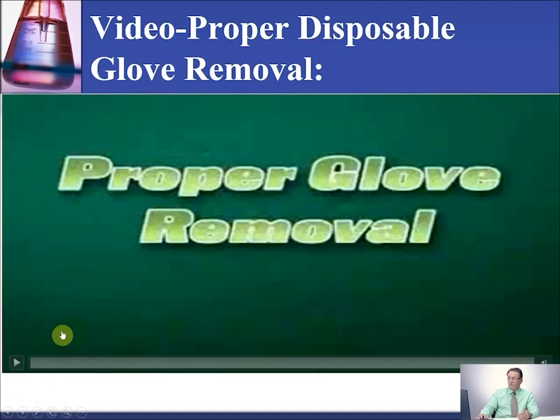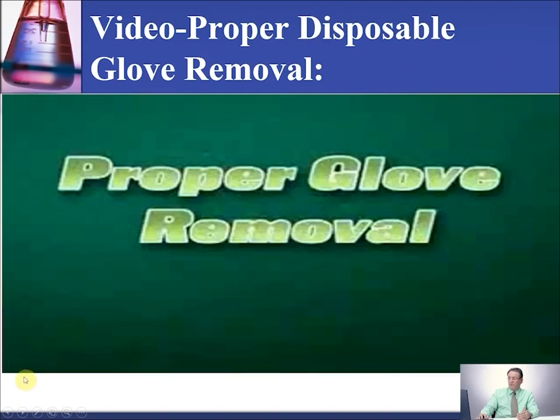This is a video that I'm going to play and show you on the proper glove removal. It's a short video, but it's a good video.